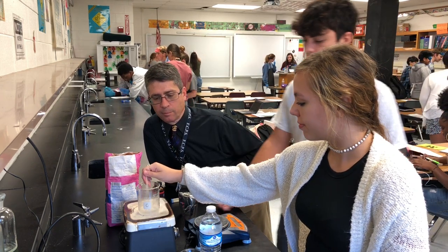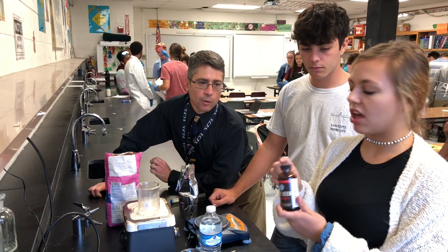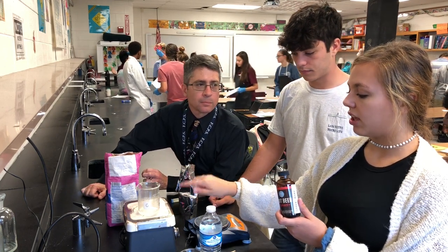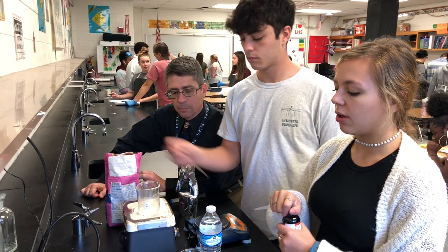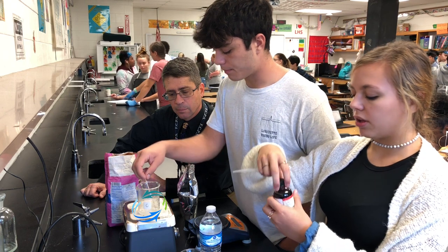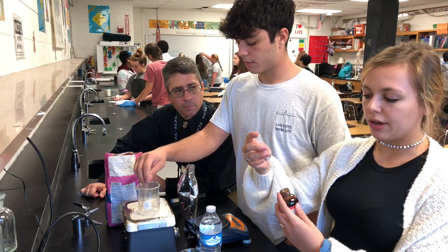Very good. All right, so what's in the bottle here? This is root beer extract. After we mix and dilute the yeast and the spring water, we're going to add 2 milliliters of root beer extract to flavor the root beer. Okay, there you go.